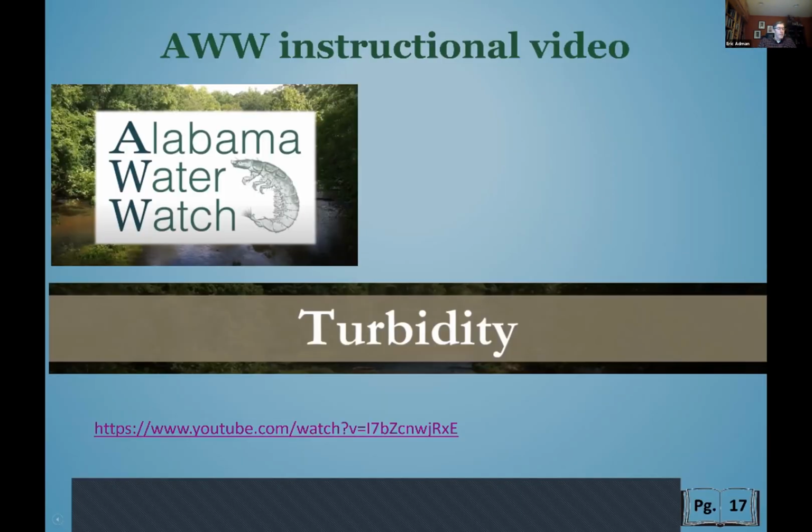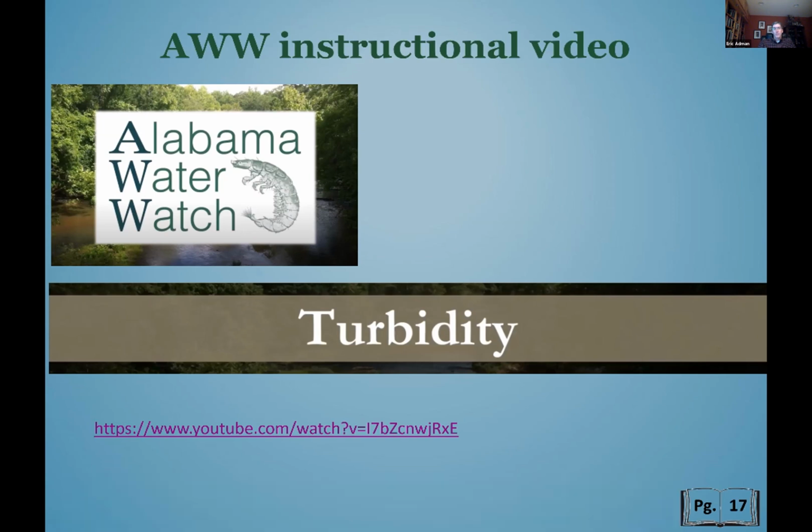So just one thing to add on the turbidity test is that they mentioned consulting the table in your manual, and the data sheet has the calculation built right into it. So when you record your addition, it will tell you how to multiply it out based on the sample size that you used.